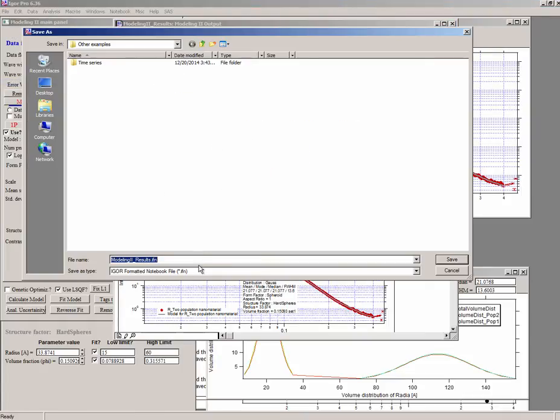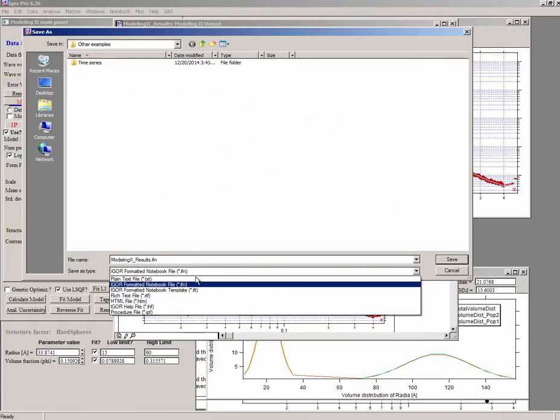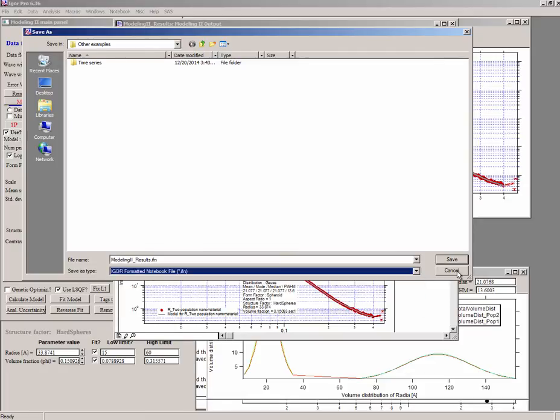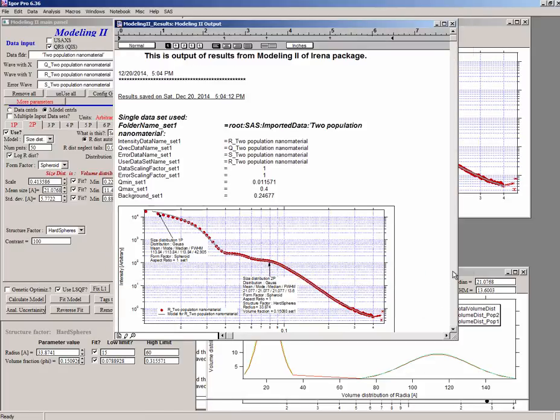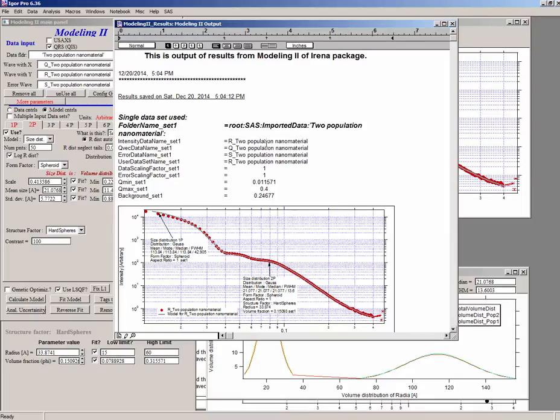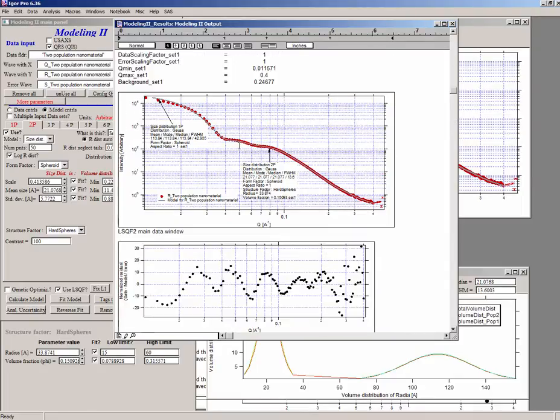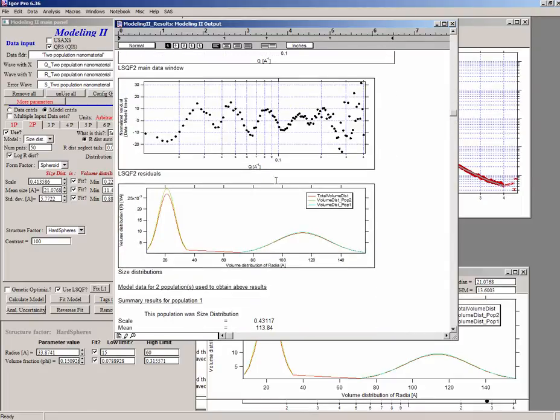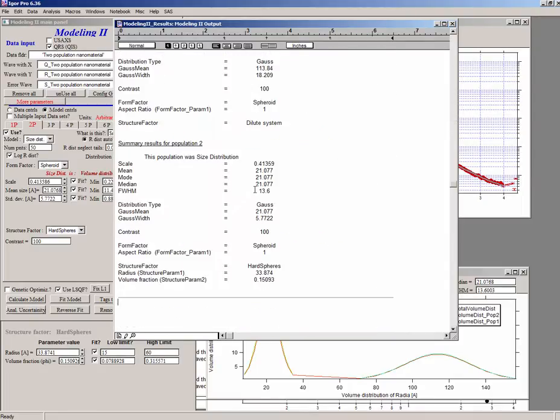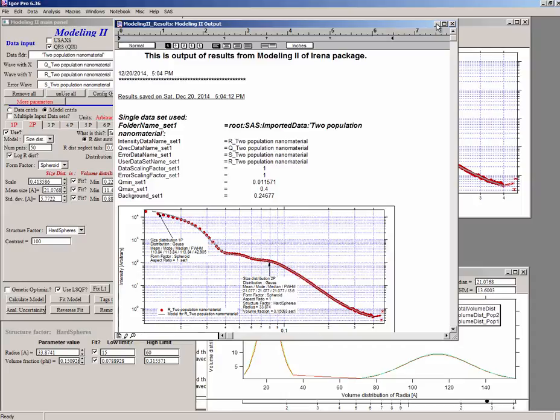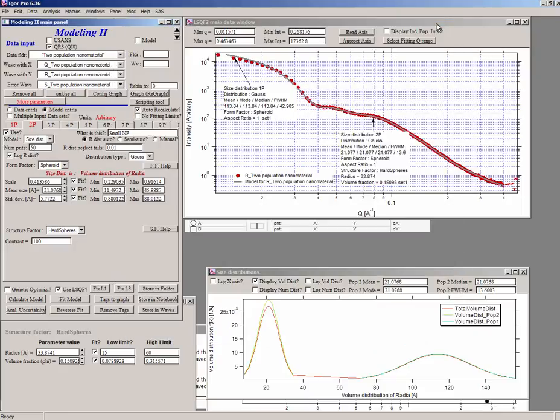And if you do it, you can then open it in a text document, in a word document, in Word or some other thing. Then it makes some records here, including the graphs, including everything, what it knows about that. So you can generate a text output, which you can then store the data in, the results in and then export it and have it as a notebook.